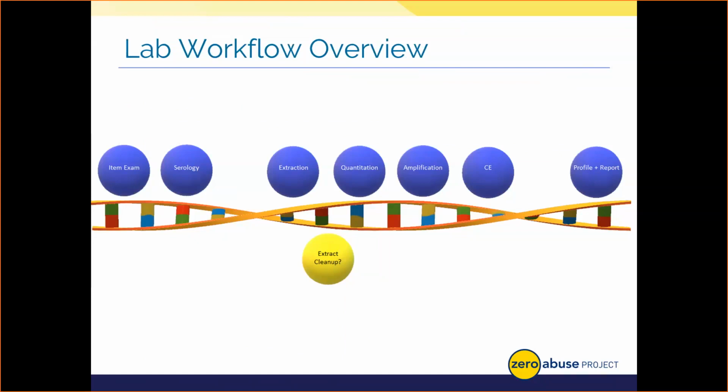And that's assuming no contamination or no mixtures, right? That these are just robust samples with great DNA and high amounts and so on. You also need to realize that analysts may be sharing workspace and equipment too. And if that's the case, it could take months in some cases for labs to get results turned around.